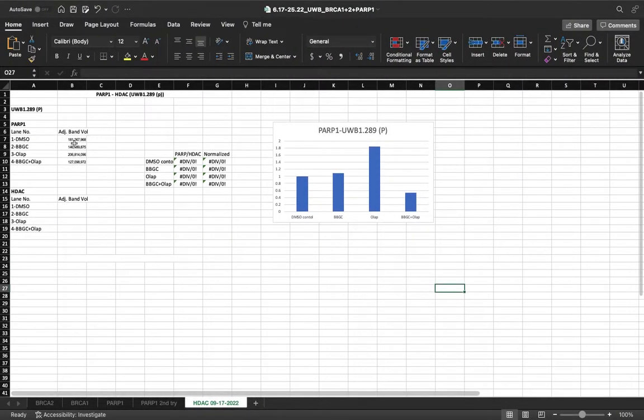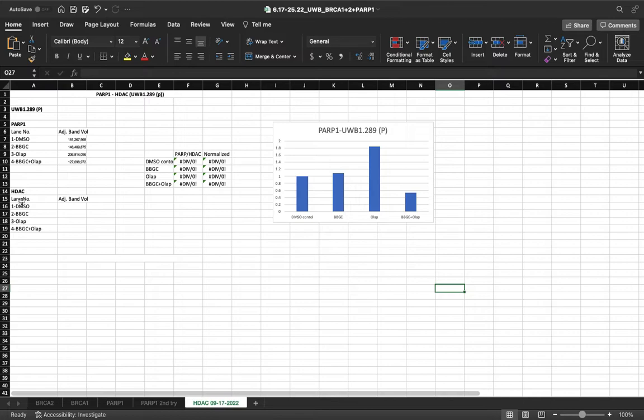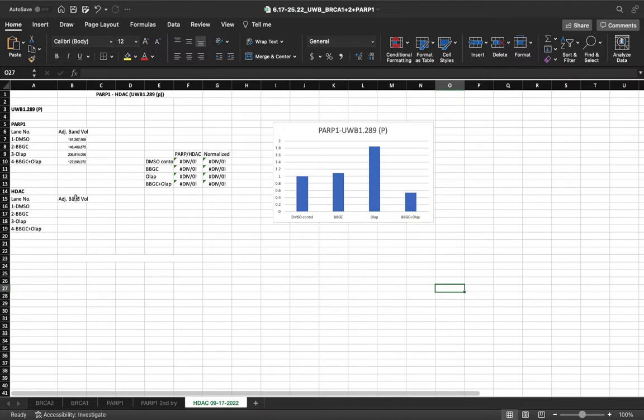Now, in order to calculate or really quantify our blots, we need to use Excel. Here is an example. We will be using PARP1 as the protein that we're detecting. And HDAC will be our loading control. And this is what we have information on. This is what we have data on.